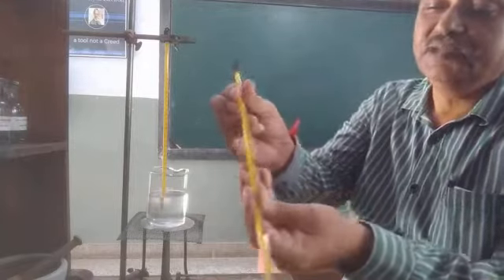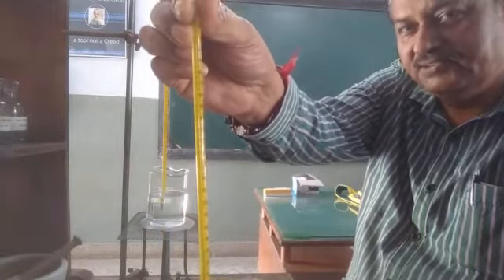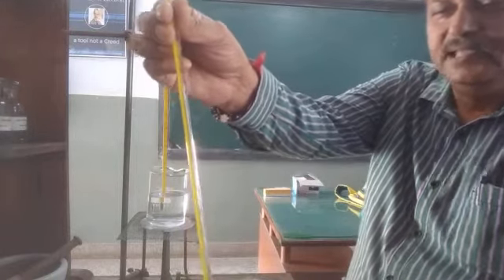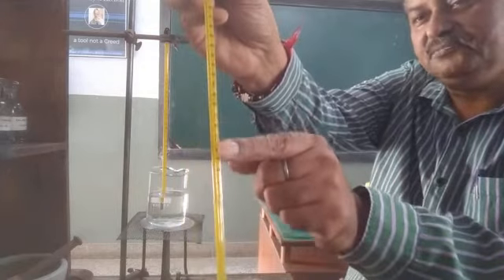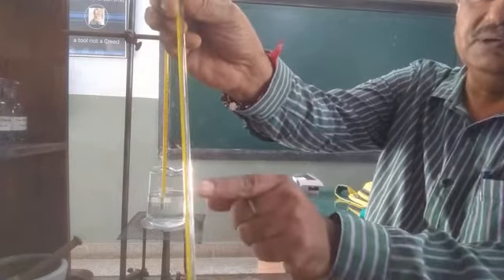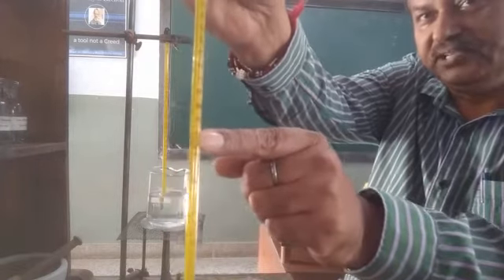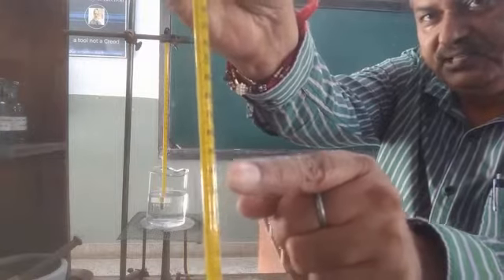And see here, there are the calibrations. We can see the temperature, and see the mercury thread. This is called the mercury thread, and just now it is showing the temperature. See carefully. It is showing 30 degrees Celsius. Room temperature is 30. So this is one point about the thermometer. How to use the thermometer?